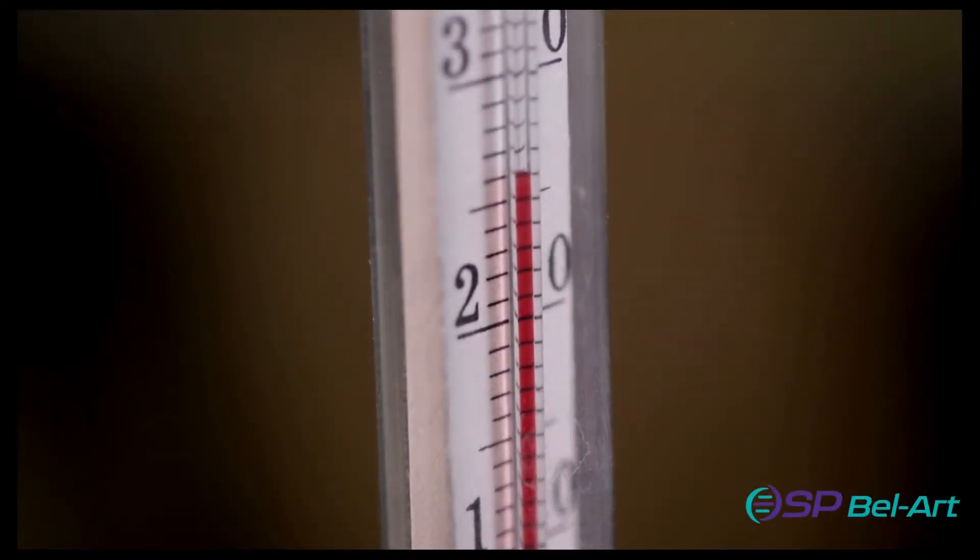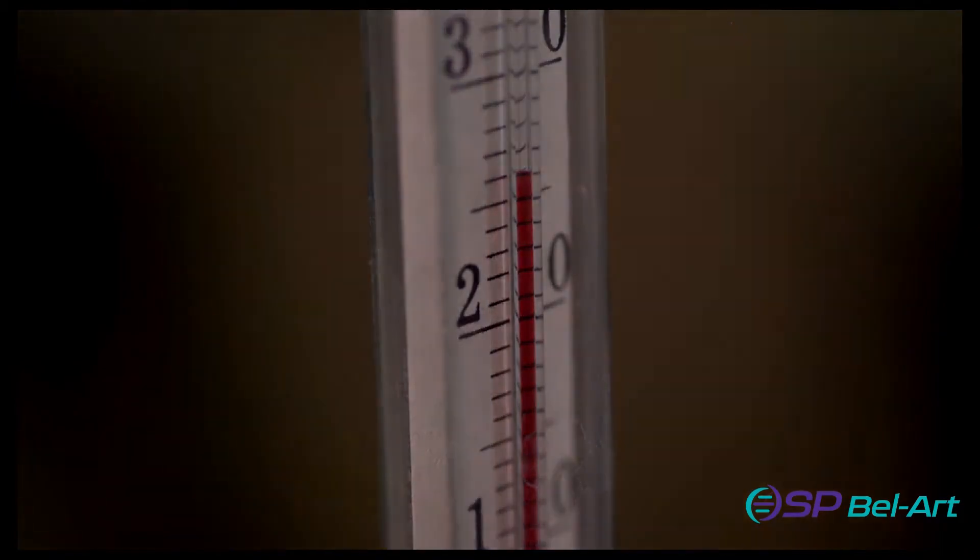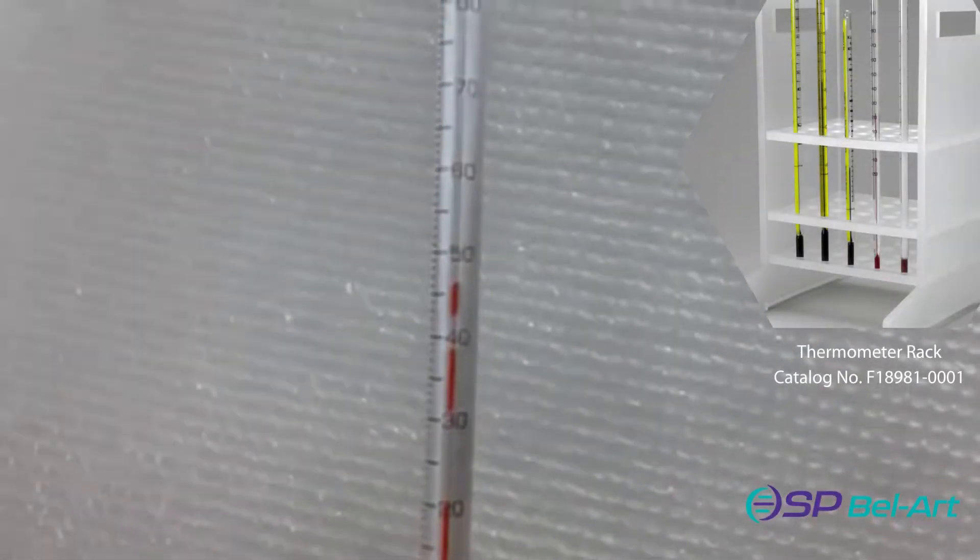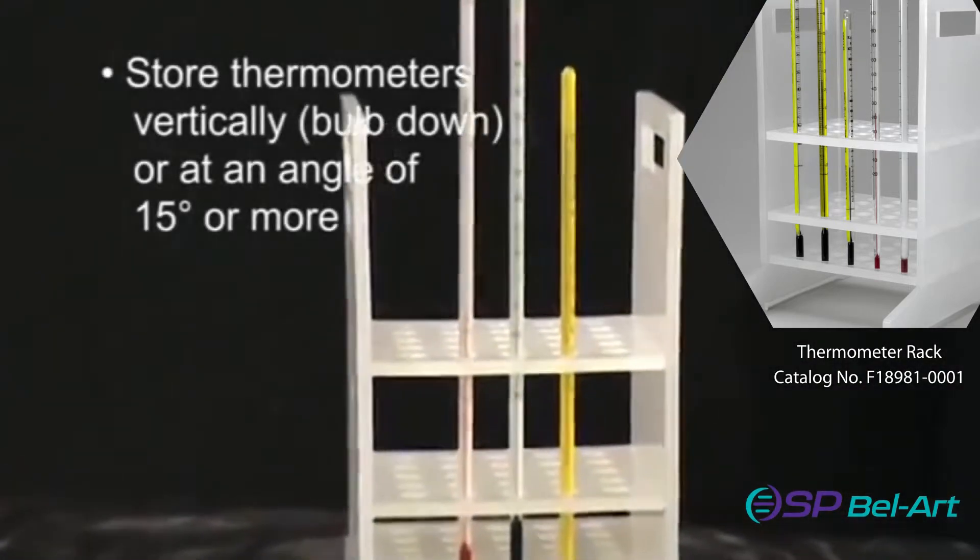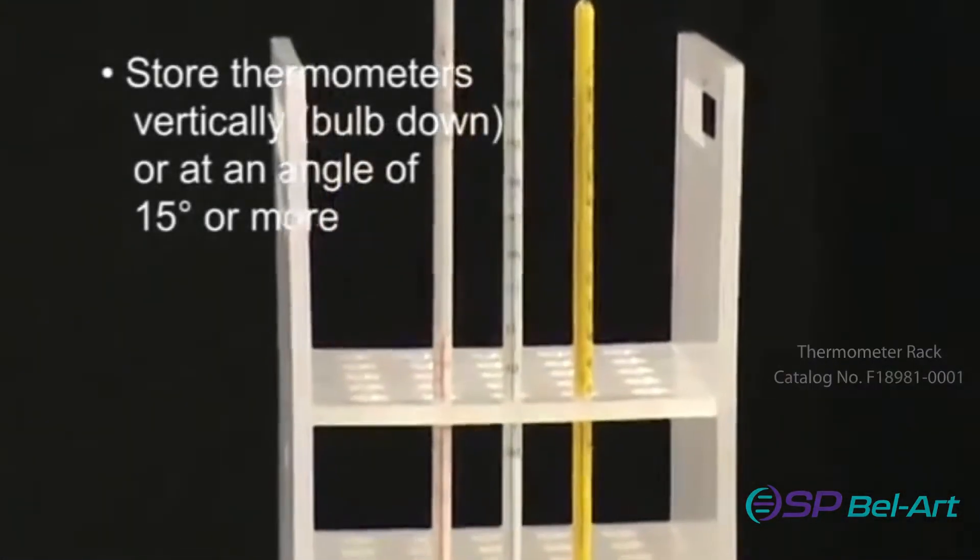Separation in a liquid column can occur in shipping and handling or as a result of horizontal storage. To prevent separation in storage, we recommend you store your thermometers vertically or at an angle of 15 degrees or more.